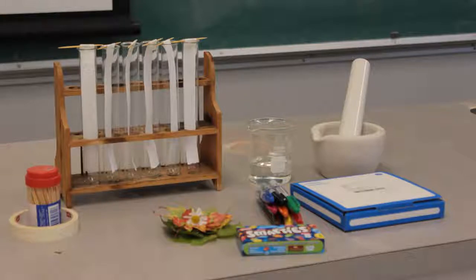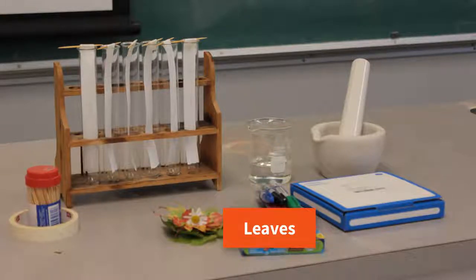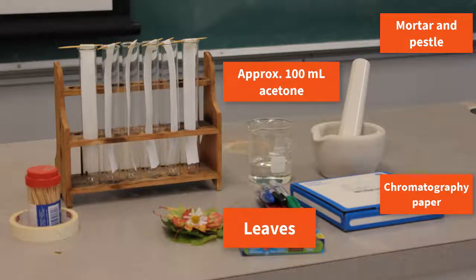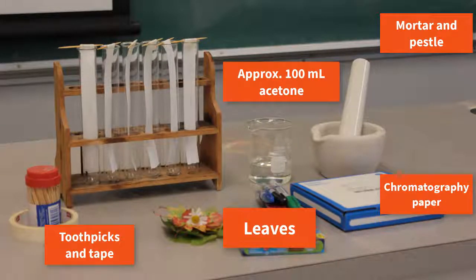For this lab, you will need some leaves to draw the pigment from, chromatography paper, a mortar and pestle, about 100 milliliters of acetone, toothpicks and tape, and some test tubes in a test tube rack.